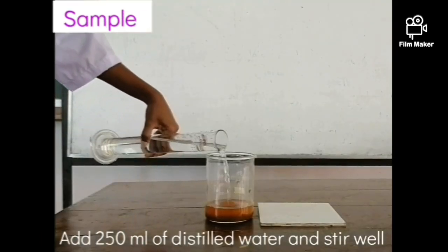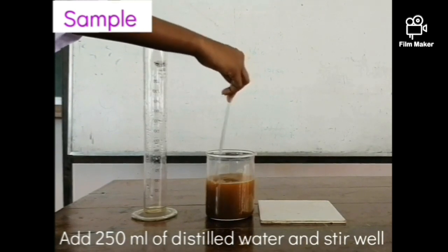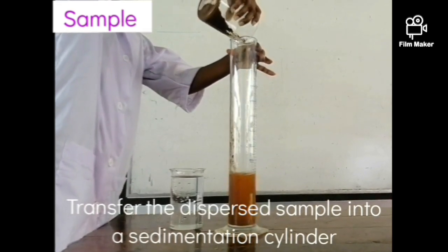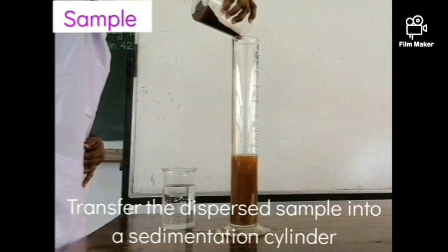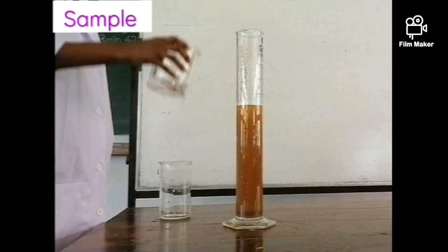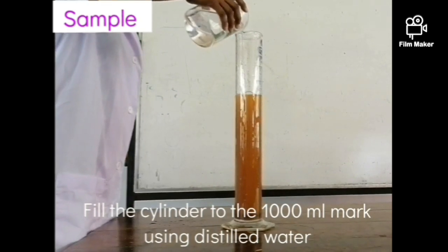Add 250 milliliters of deionized water into the beaker of soil solution and stir it well using a glass rod. Then transfer the dispersed sample into a sedimentation cylinder and fill the cylinder with deionized water to the mark of 1000 milliliters.